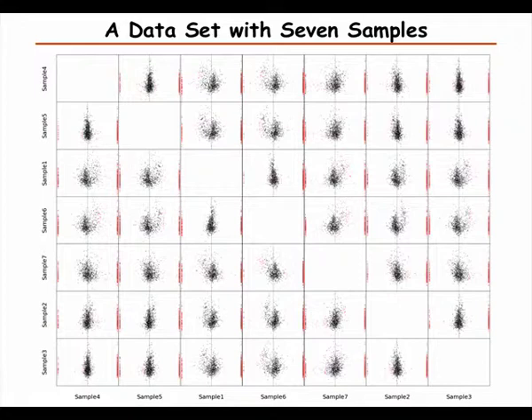You had a question? Yes. For the outliers, they have some complication in one sample, but not in the other sample. So that's the extreme outliers, but there are also ones marked in red here, for example. So we're looking at outliers. Usually in this case we use the non-parametric approach. We look at the median and then the interquartile range to estimate what's an outlier.